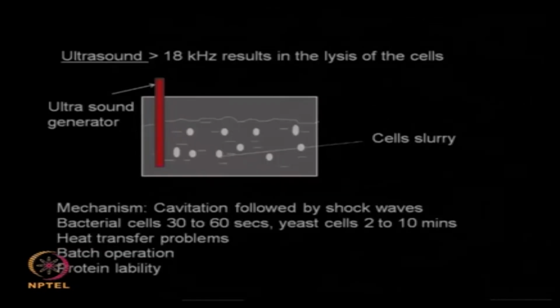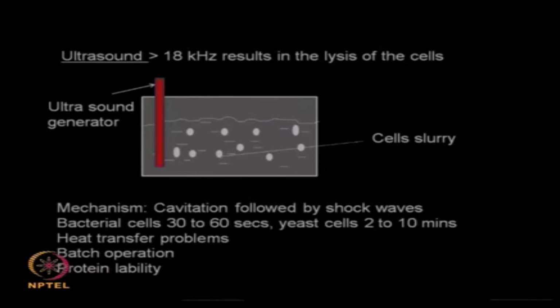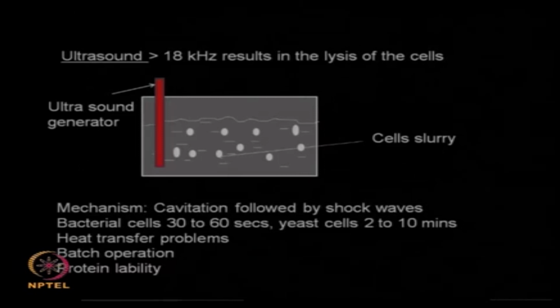Another technique which can be used for breaking your cells is called ultrasound. Ultrasound above 18 kilohertz can help in breaking the cells.